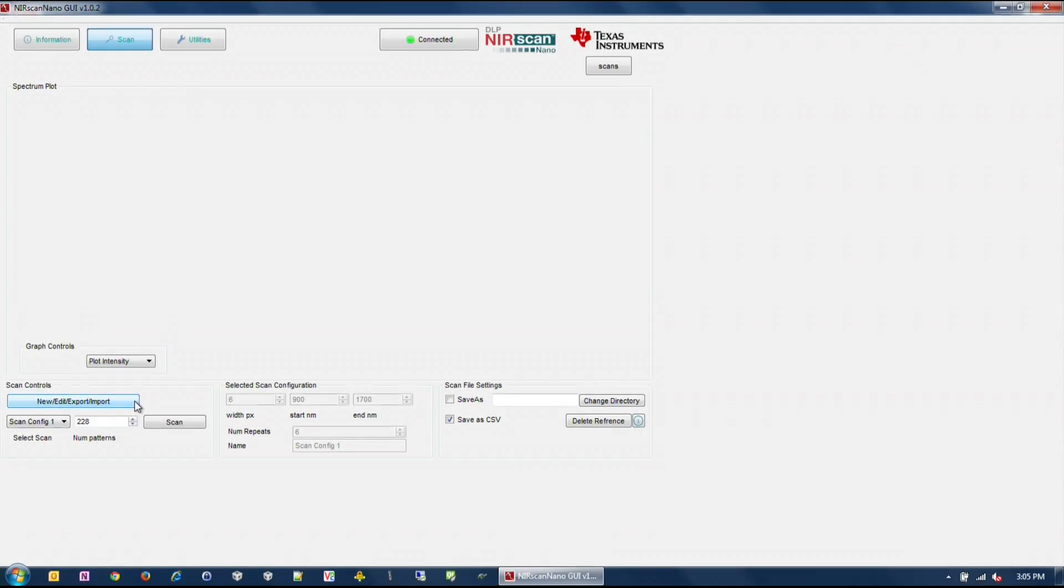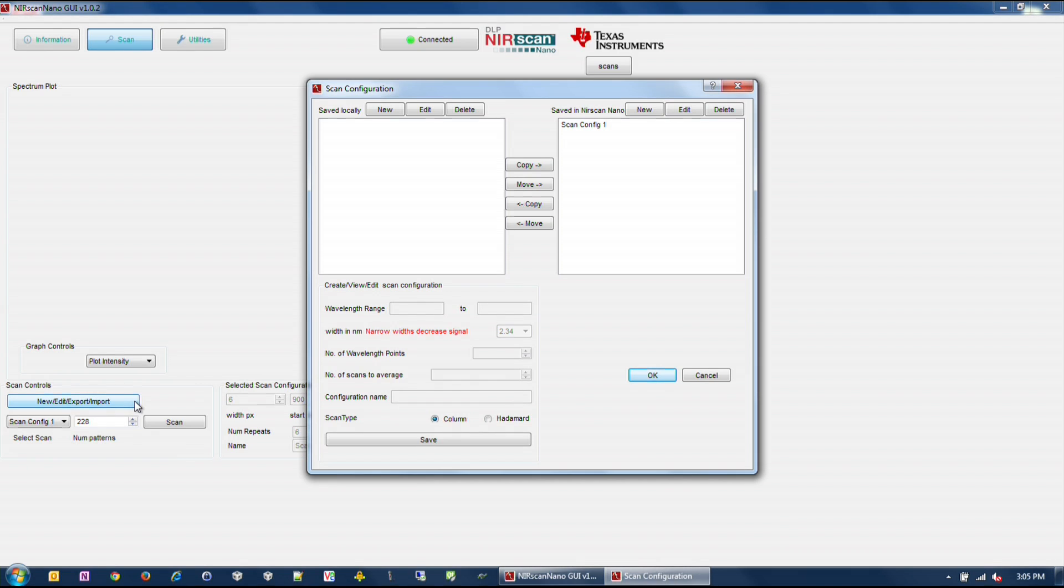To create a scan configuration, click on the New Edit Export Import button in the Scan Control box to invoke the Scan Configuration dialog box. The Scan Configuration dialog box has three sections.